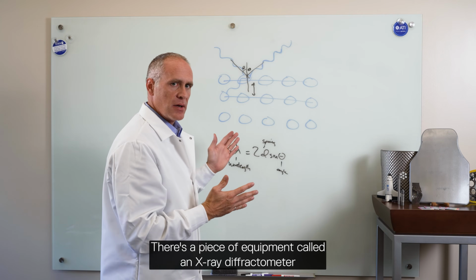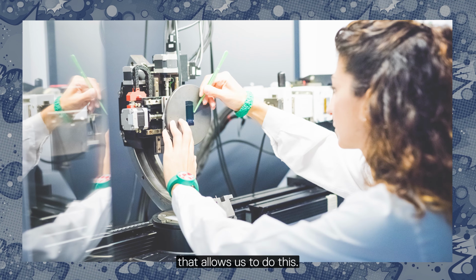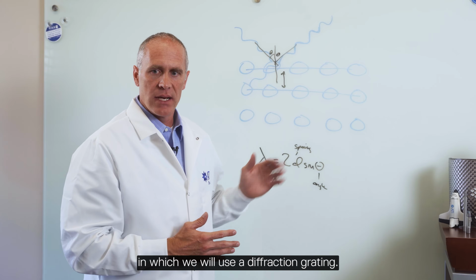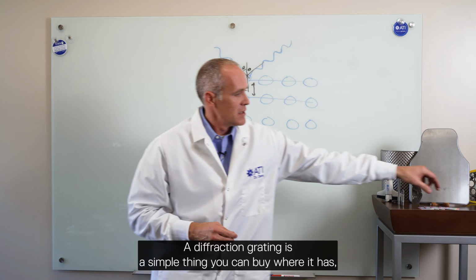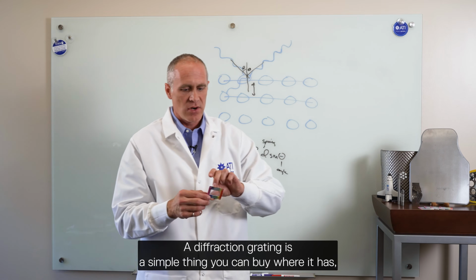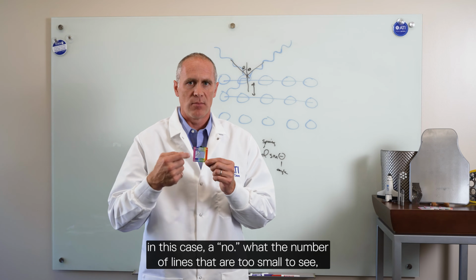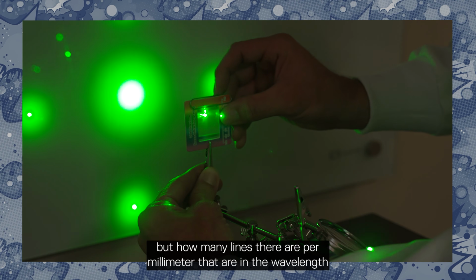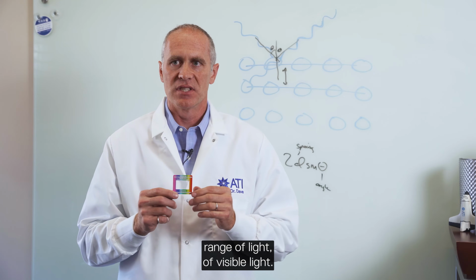X-rays of metals. There's a piece of equipment called an X-ray diffractometer that allows us to do this. We have the ability to do a similar experiment using visible light, in which we will use a diffraction grating. A diffraction grating is a simple thing you can buy where it has a number of lines, too small to see, per millimeter that are in the wavelength range of visible light.